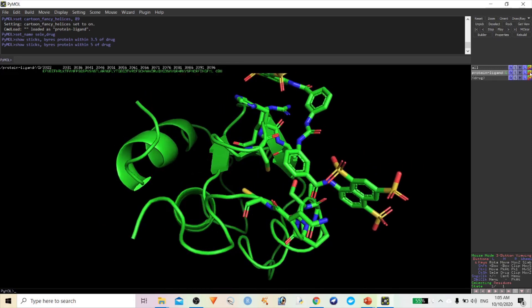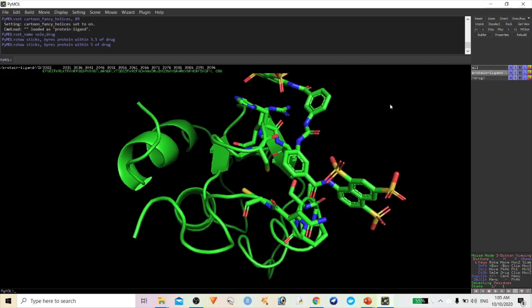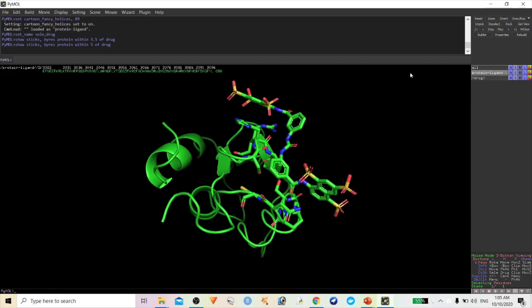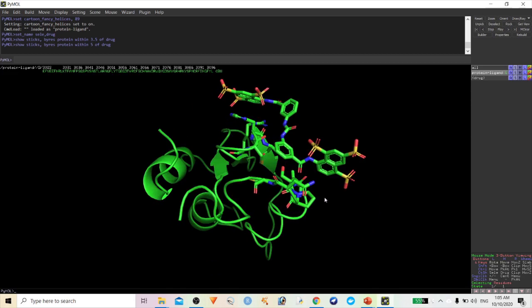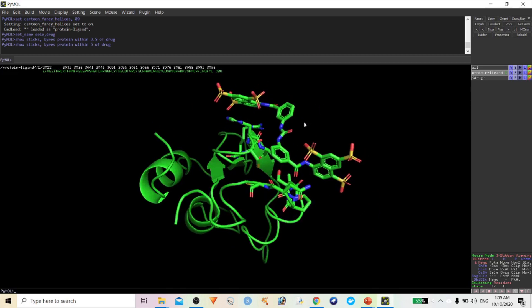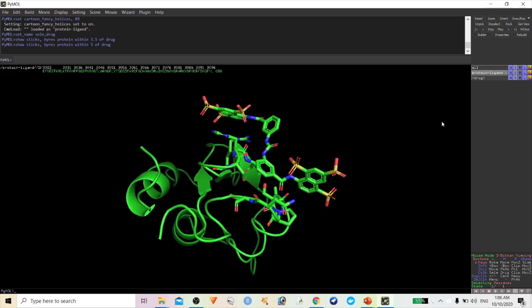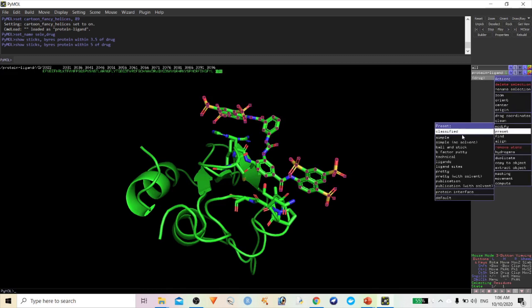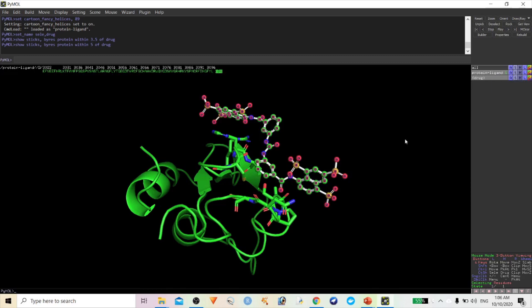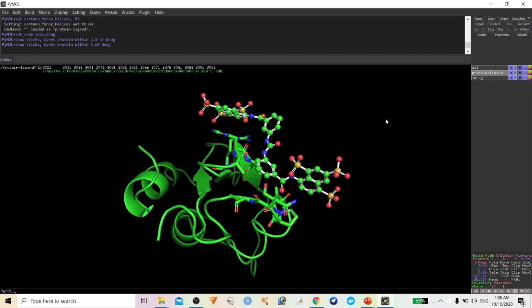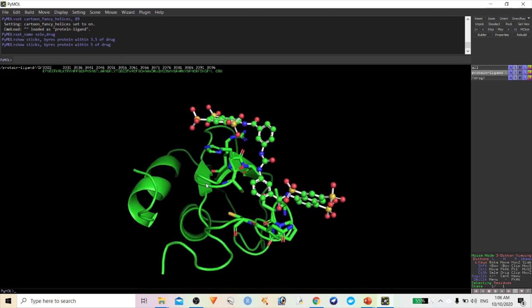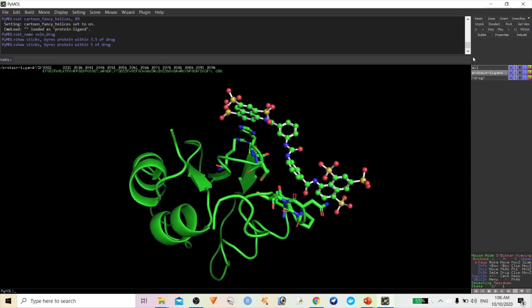The amino acid stick conformation is merged with the protein molecule, so you cannot differentiate between the ligand and protein molecules. You can give different structures: go to Action, Preset, and Ball and Stick. Now you can clearly differentiate the protein and ligand molecule.